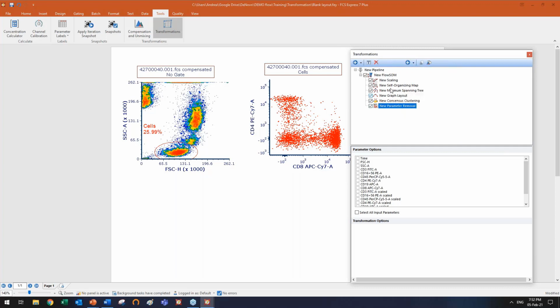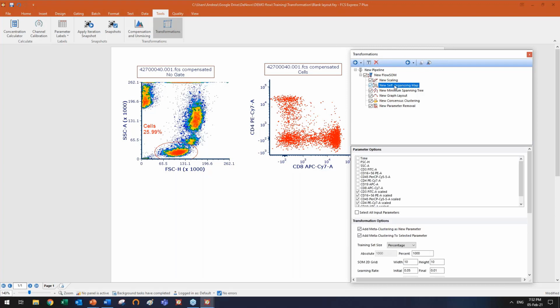Okay, the idea is that along the pipeline you may create a lot of different parameters that are required within the pipeline but not in the final plots. Okay, so here we are scaling 5 parameters, and as you can see here, the parameter list is longer because it includes both the unscaled and the scaled.